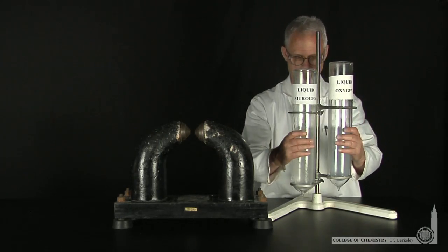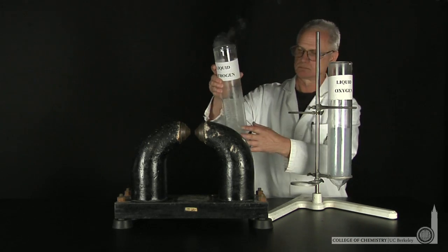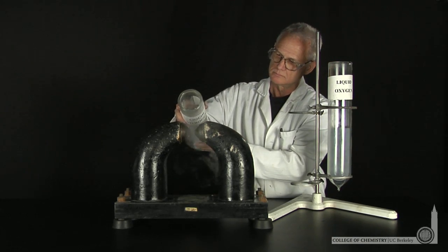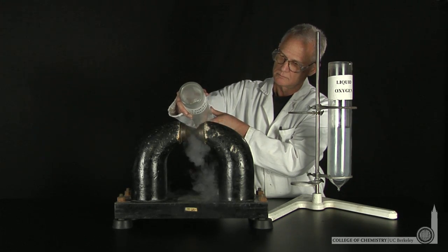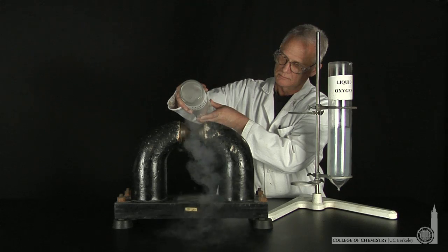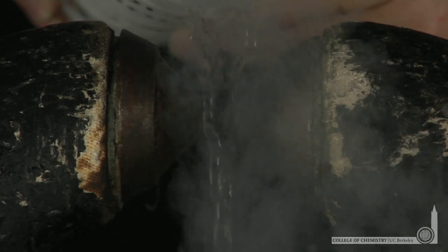In the demo lab, Lonnie's prepared liquid oxygen, liquid nitrogen, and a strong magnet. He's going to pour liquid nitrogen across the poles of this magnet. Now, liquid nitrogen, based on our molecular orbital theory, is diamagnetic. All the electrons are paired.